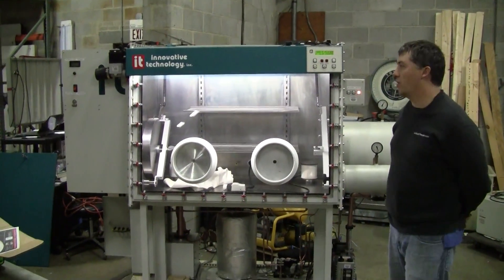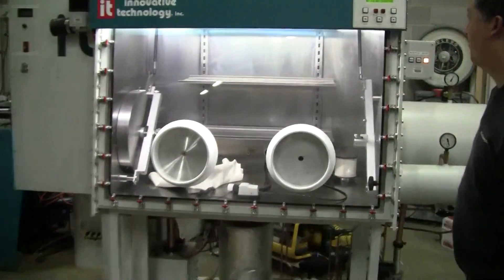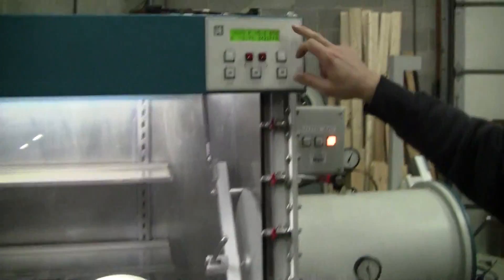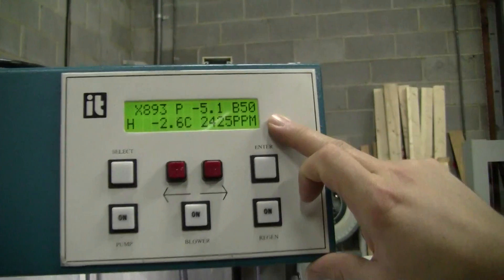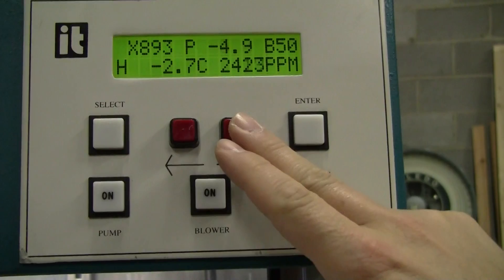Hi, this is Michael Natal from Hi-Tech Trader. This is the Innovative Technologies Clubbox. First of all, we want to indicate that the oxygen sensor is working properly. It needs calibration, but that can only be done on site when it's installed.